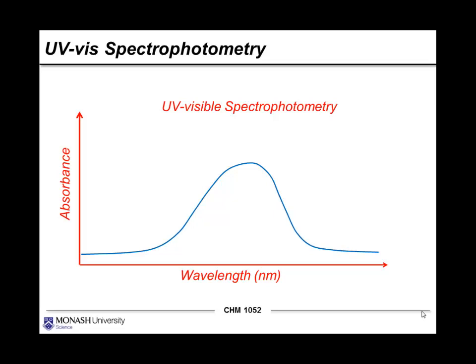And what we'll be focusing on is the point of maximum absorbance, what we often call lambda max, lambda being the Greek symbol which we use to denote wavelength. And even though lambda max doesn't line up perfectly with delta O, it's pretty close. And so for this first year experiment, it's a pretty good approximation, which we can use to measure that energy splitting, or that crystal field splitting energy.